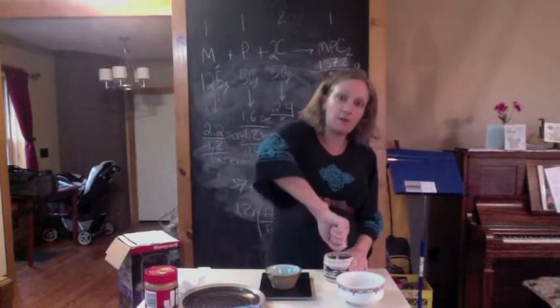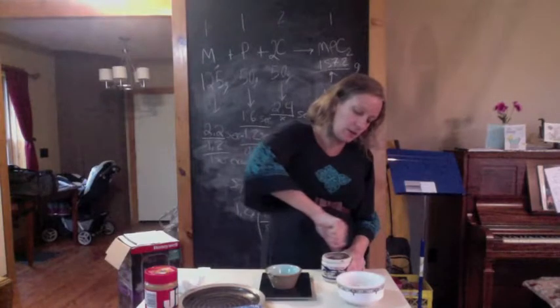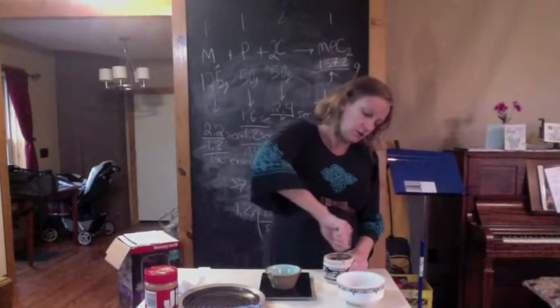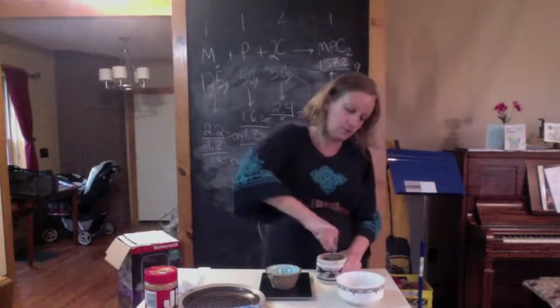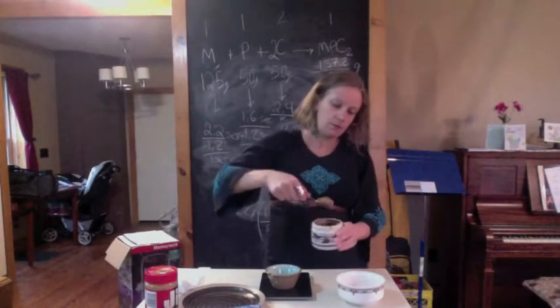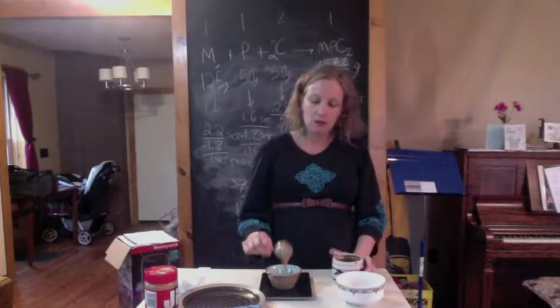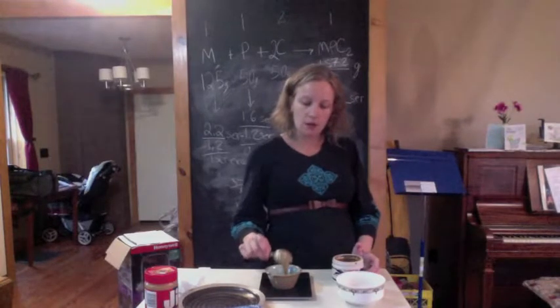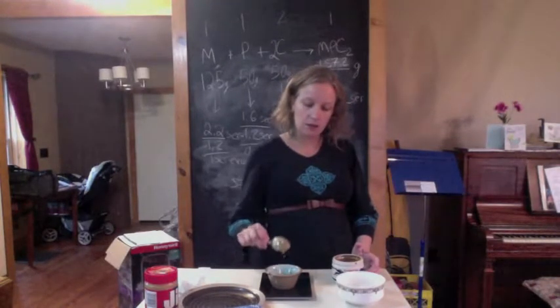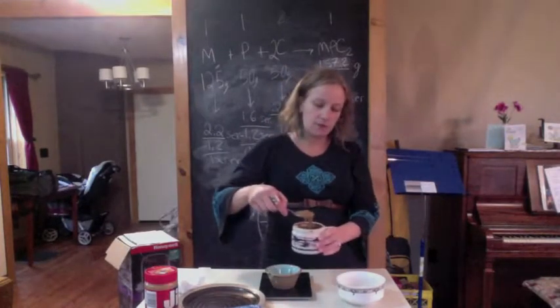We need to measure 50 grams of the maple cream and 50 grams of the peanut butter. I know that 1 tablespoon weighed about 21 grams, so that gives me an idea of how heavy this is. I'm scooping a large portion at once, and that's 23 grams, trying to get up to 50.